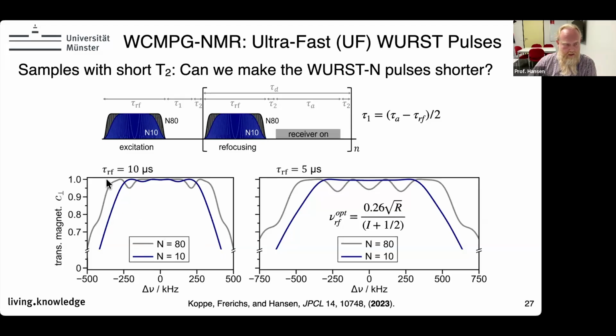80, which gives you these amplitudes, these non-uniform excitation, but then you can sort of compensate this by decreasing the shape parameter. And you get, say, it's not perfectly flat, but it's almost flat. And it's something you don't see experimentally if this is within 2-3%. So you can make it 10 microseconds.